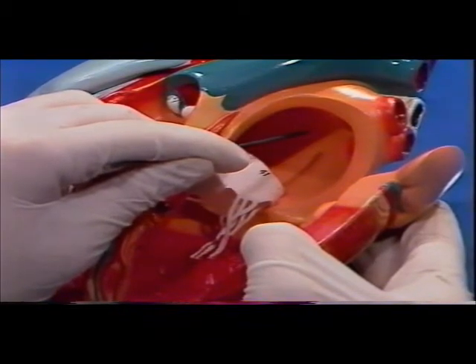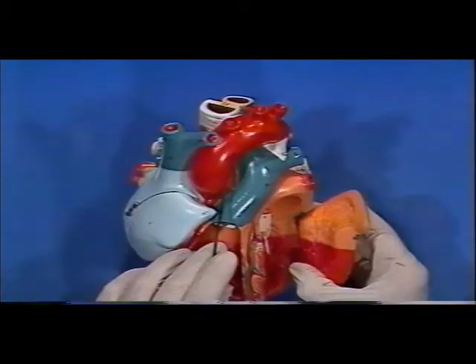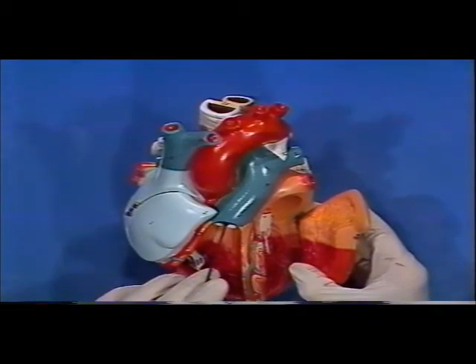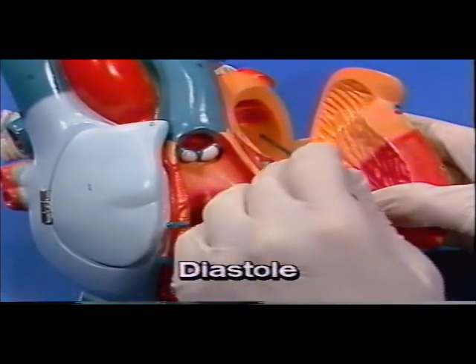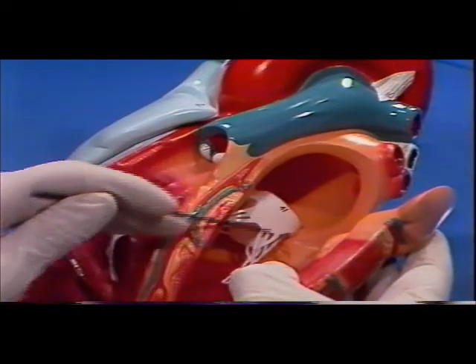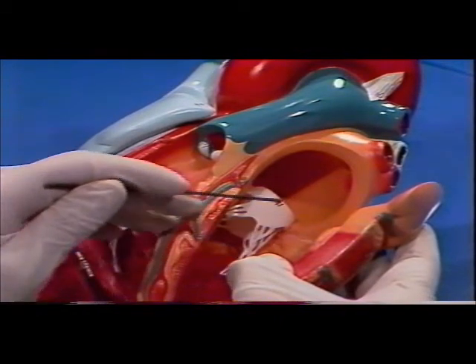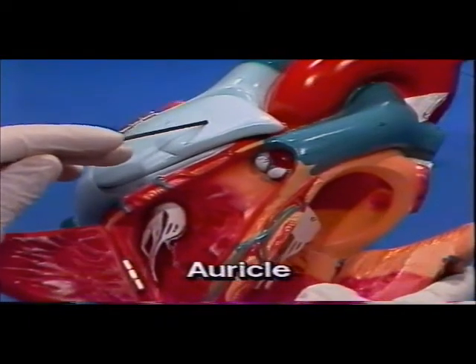The blood is instead forced to leave the left ventricle by way of the aorta and the right ventricle by way of the pulmonary trunk. When the heart relaxes again, it is said to be in diastole. Blood then flows from atria, plural for atrium, an entryway, into the ventricles. Each atrium also has a small side chamber called the auricle, meaning ear.